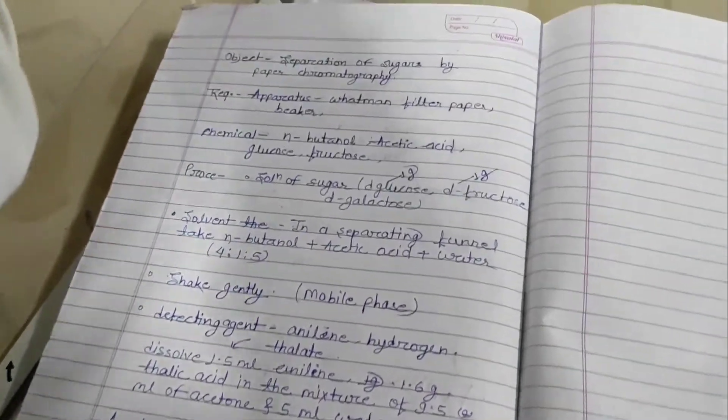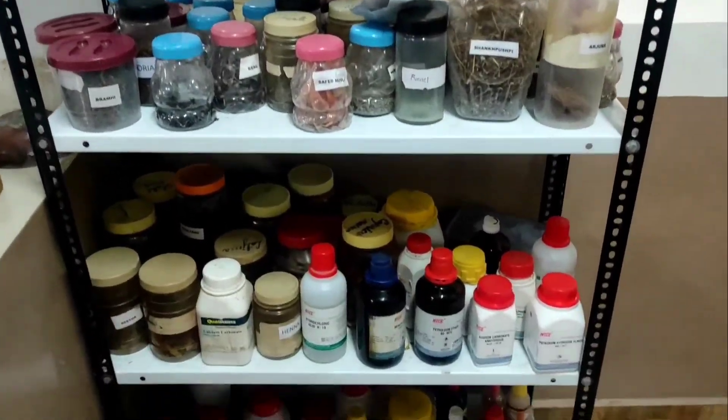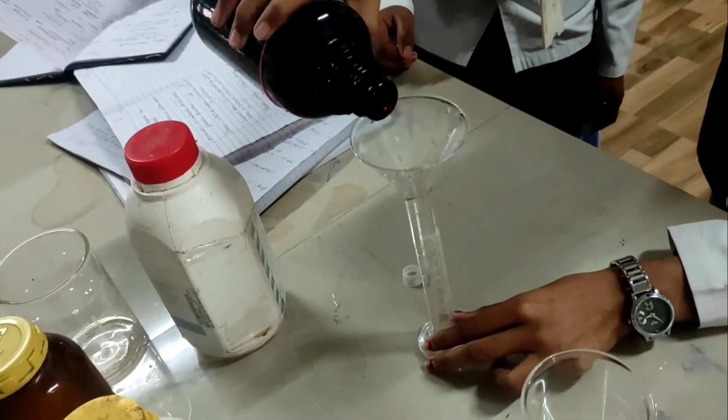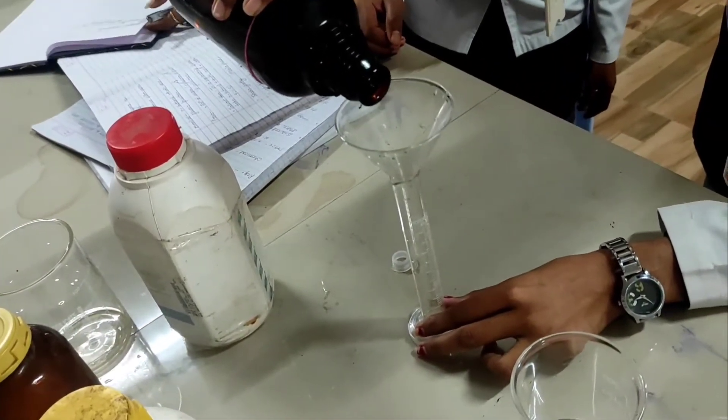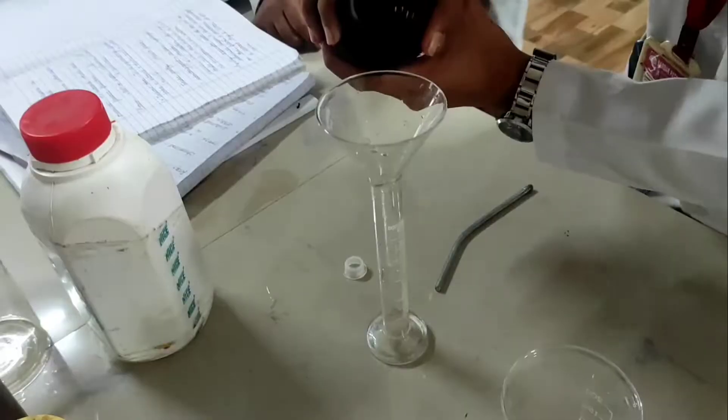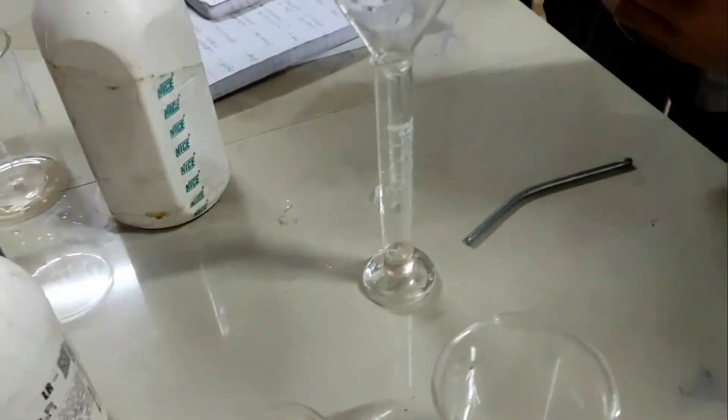Let's talk about the basic requirements to perform this practical. First, what are the chemicals required? For the solvent system, we have to use a mixture of three chemicals in a ratio 4:1:5. The first is n-butanol, acetic acid, and water, a combination of these in the ratio 4:1:5, which can be used as a solvent system for performing this practical.